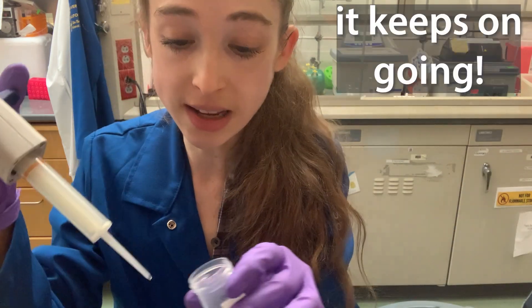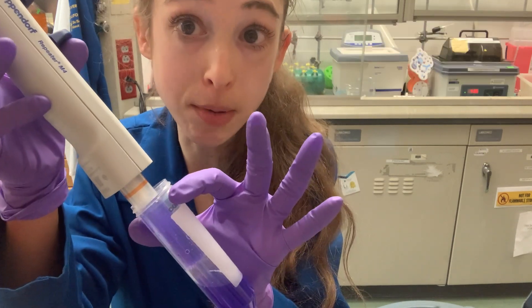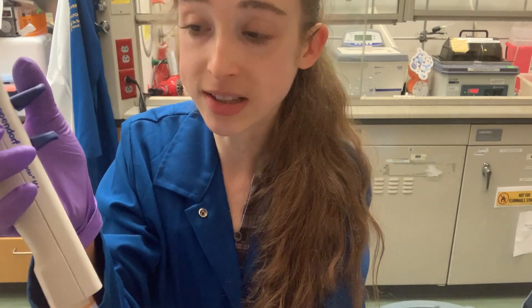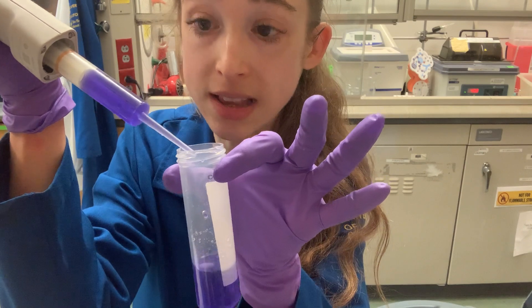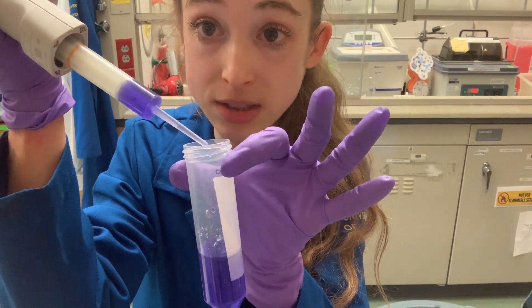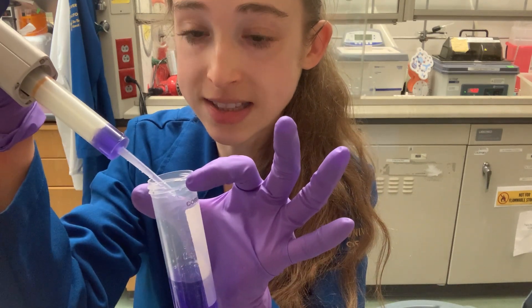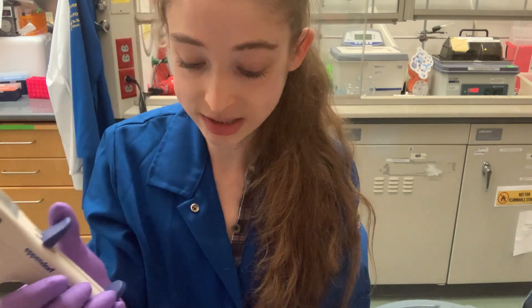It's like the Energizer bunny of pipettes. You aspirate up once — a much larger amount than you're going to push out each time. You can set the step size to dispense different portions. Each time you press the lever, you get a single step out. With a smaller tip, you can do even smaller portions.